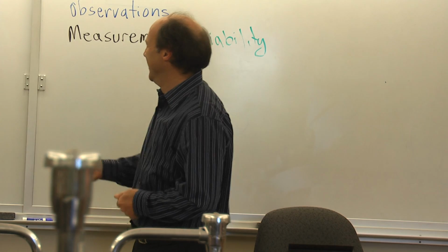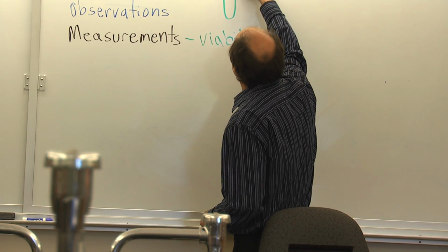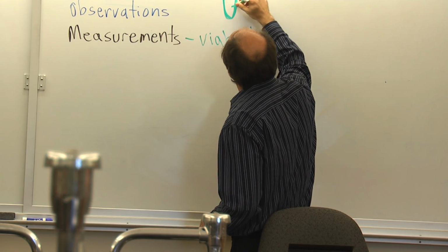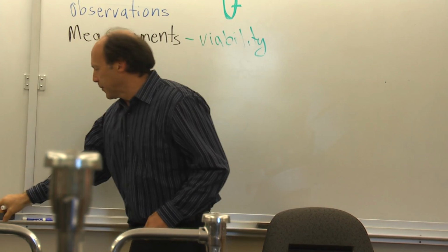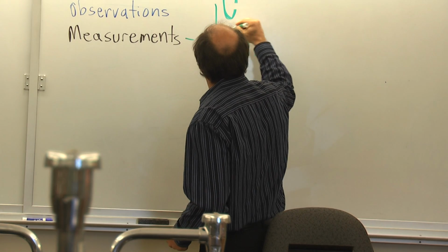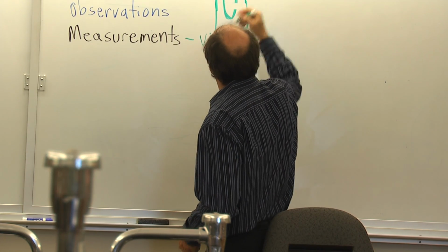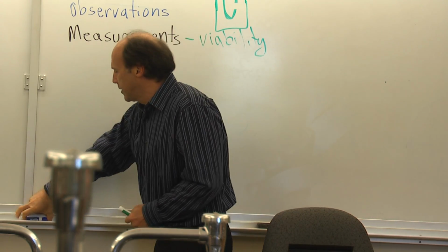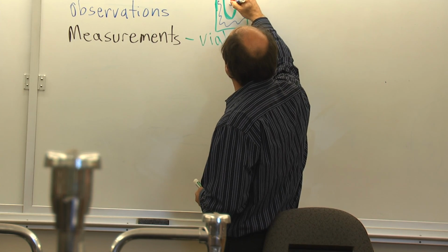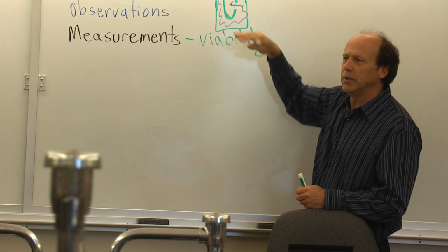You guys know this, right? It detects a cell. There's an aperture, which is basically a small pinhole in the side of the tube here, and this whole thing is sitting inside of your vial, which has your test sample in it. As your test sample is drawn up into the pinhole of this tube, it comes down the probe, you could say.